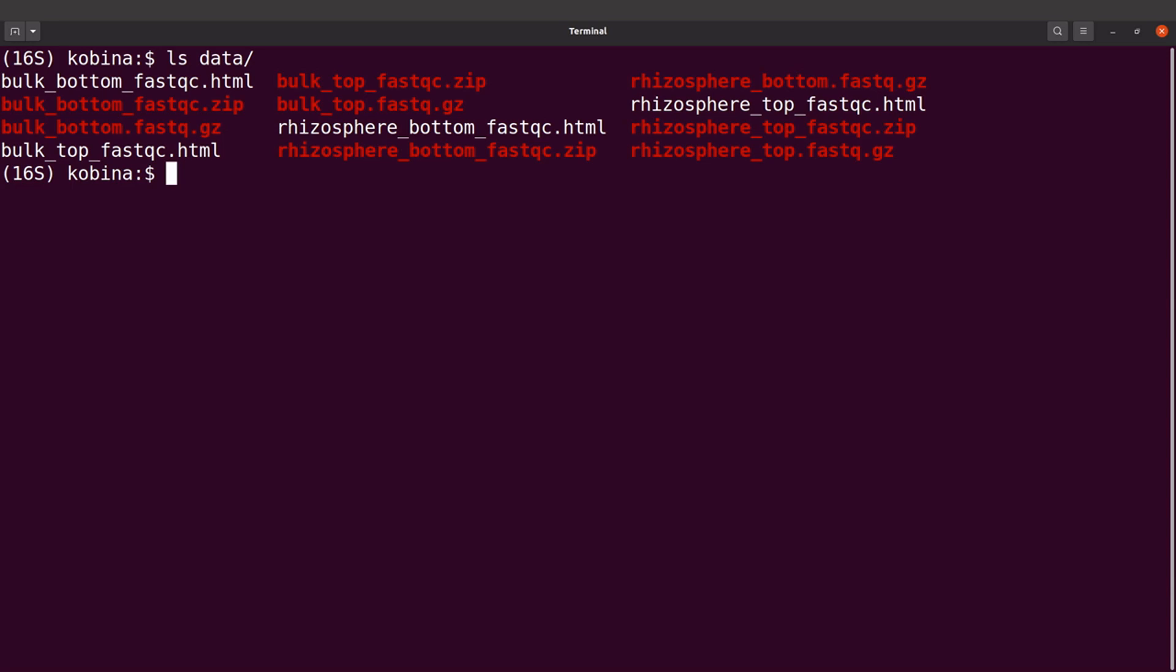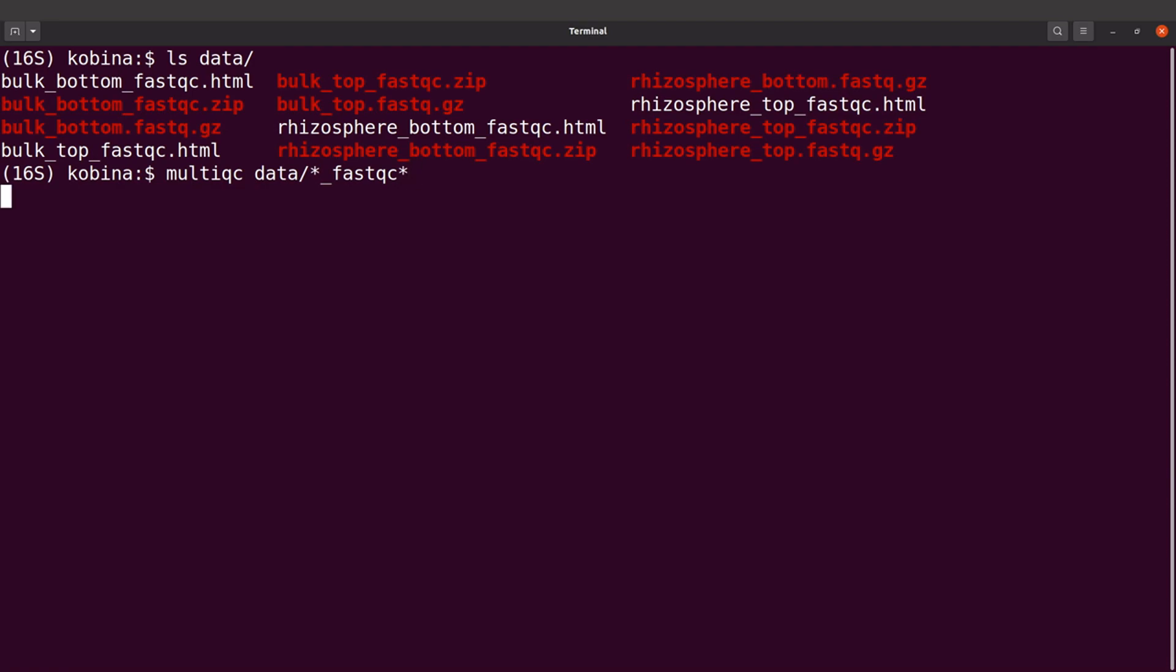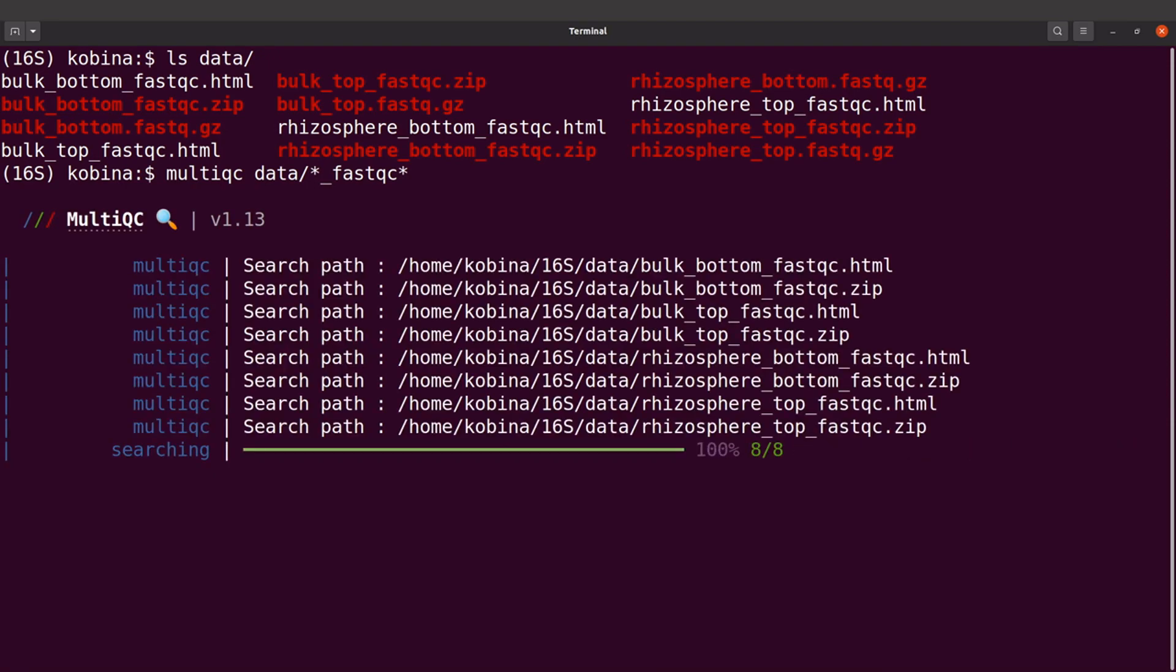We're going to aggregate everything and generate a single report that we can view using our browser. This can help us easily compare the files that we want or the files of interest. To aggregate the FastQC report using MultiQC, we'll say multiqc and then data slash star underscore fastqc star. I'll execute the command. MultiQC will automatically detect the reports and aggregate them for us.